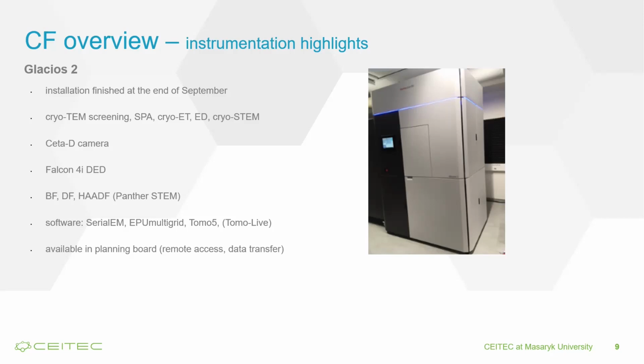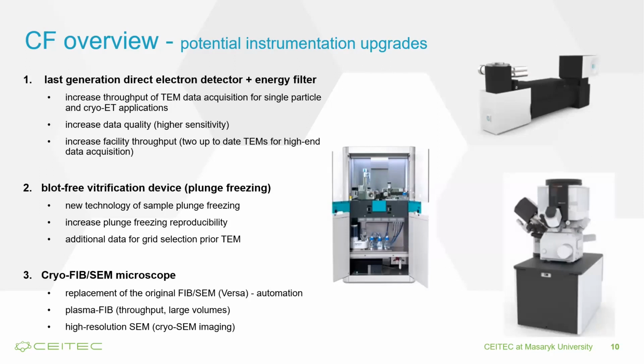For the users, importantly, this has the last generation direct electron detection camera, so your single particle data shall be of very, very high quality. And it comes with the latest software for both the single particle and the tomography, including the real-time reconstruction of the tomograms. Again, if you're interested, get in touch and get to use it. The instrument is also available in the booking board for both the reservations and the remote access. Maybe this might be of interest.